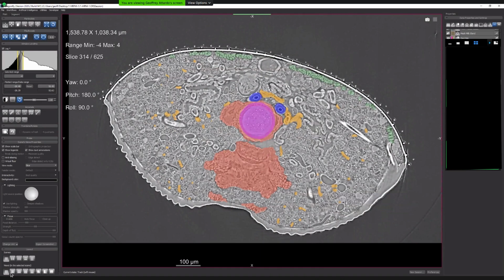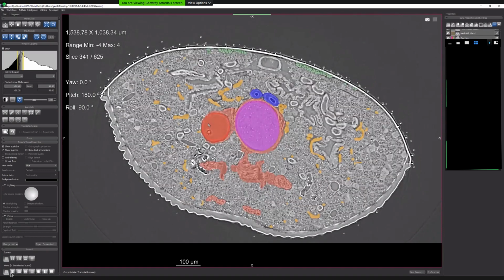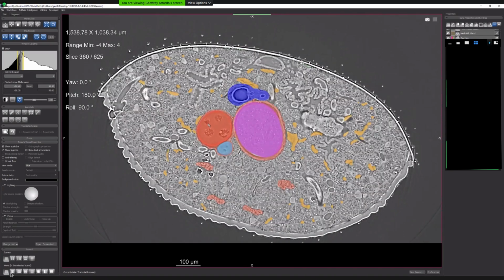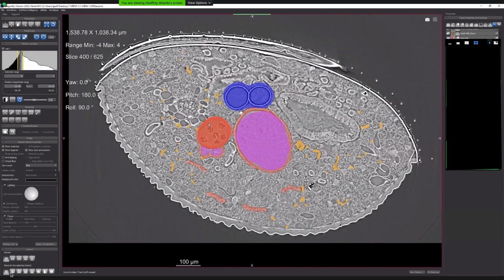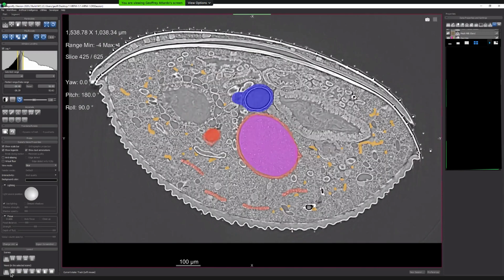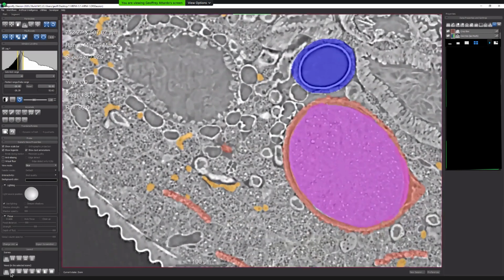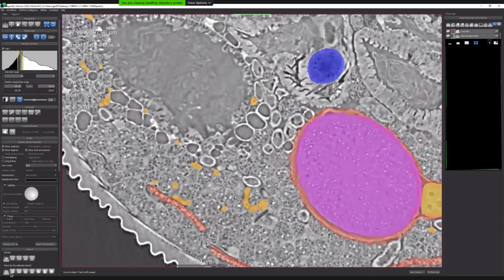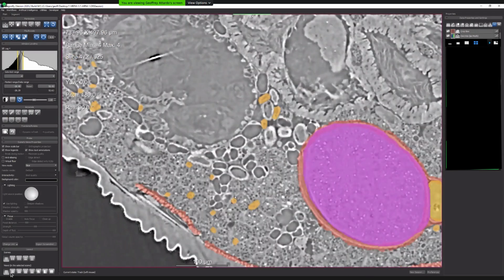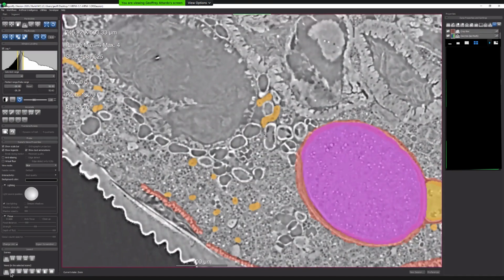So I don't know if you can see these yellow features. These are milk gland, which is an organ which the fly uses to make milk. So this is a fly that gives birth to live offspring and generates milk during its reproductive cycle. This is kind of tricky to pick out, but I went through manually and pulled all this information out with the hope that we could use it to train the deep learning algorithm.